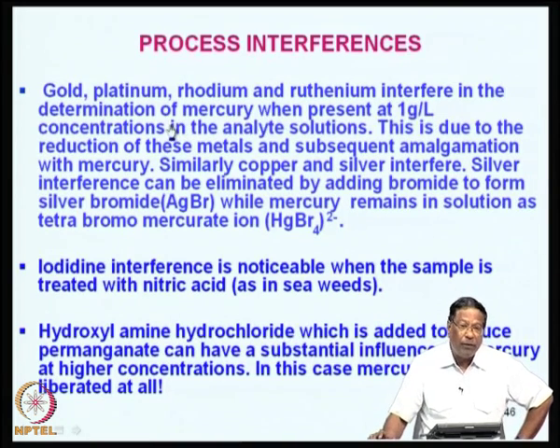So, we will continue our discussion on the process interferences in the next class. Afterwards, we will move on to flame emission spectrometry.